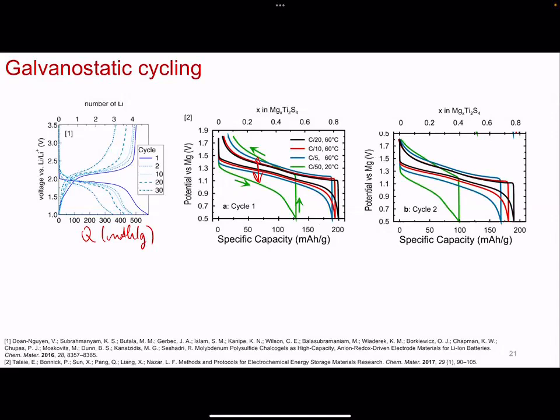Now, I think the way people are doing it now, which is just to report what they've done, is fine in the sense that as long as you're transparent and you say, this is the characterization of the material, this is what I think the material is starting with in terms of porosity, in terms of whatever material property that you can possibly report, and then plot it, but explain how you've done it based on everything you just said. I think that's the best we can do.